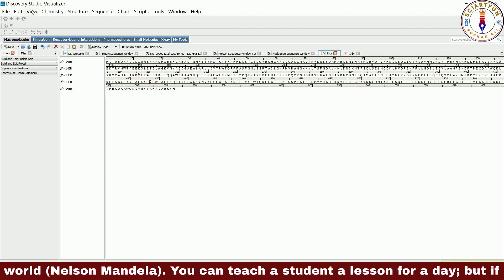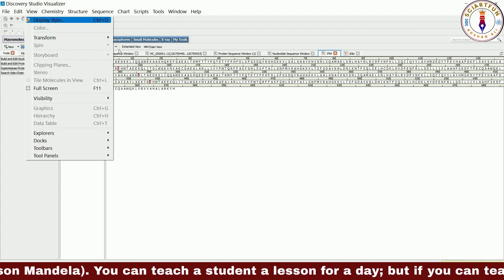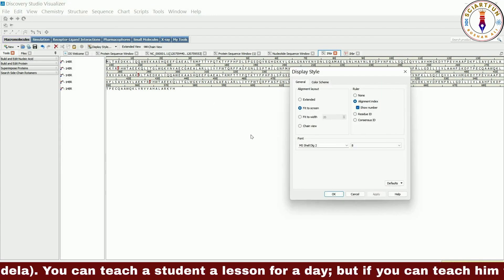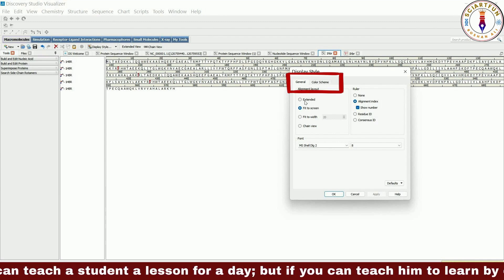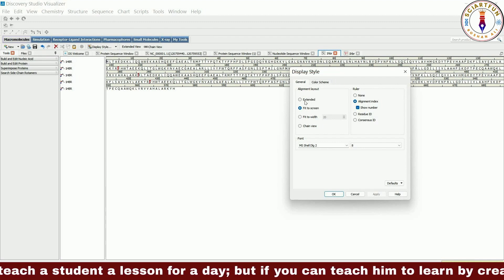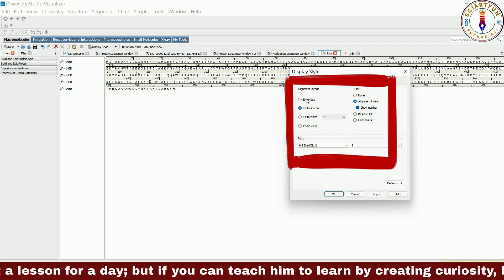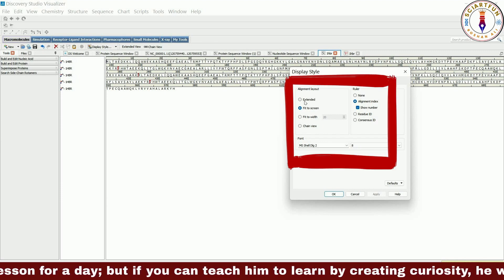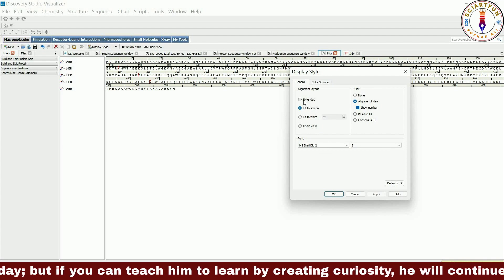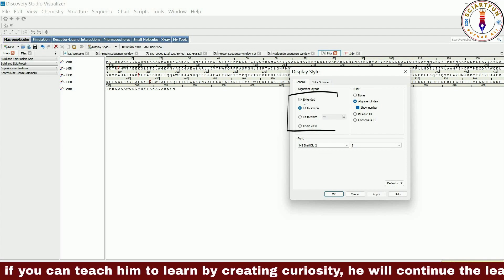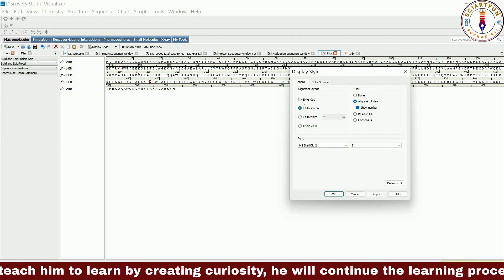Now let's open the display style dialog box for this sequence window. Here we have two main tabs: a general tab and a color scheme tab. In the general tab we have three portions: alignment layout, ruler, and font. In the first portion we have four options: extended, fit to screen, fit to width, and chain view.